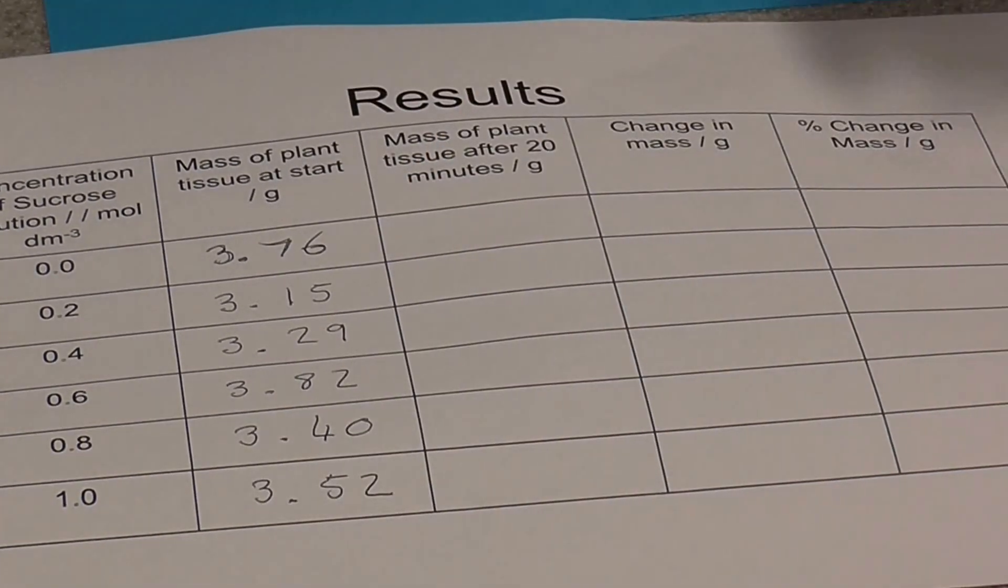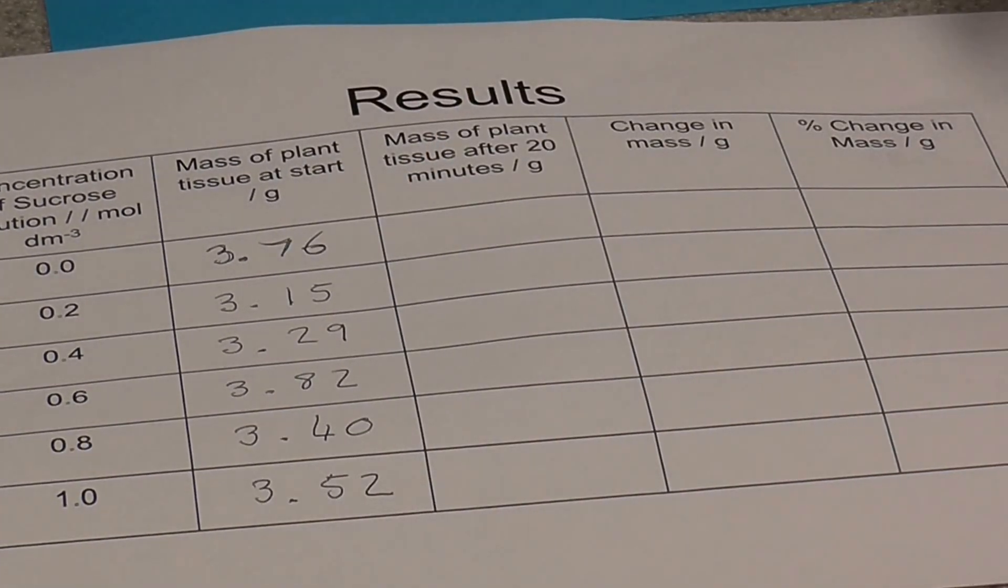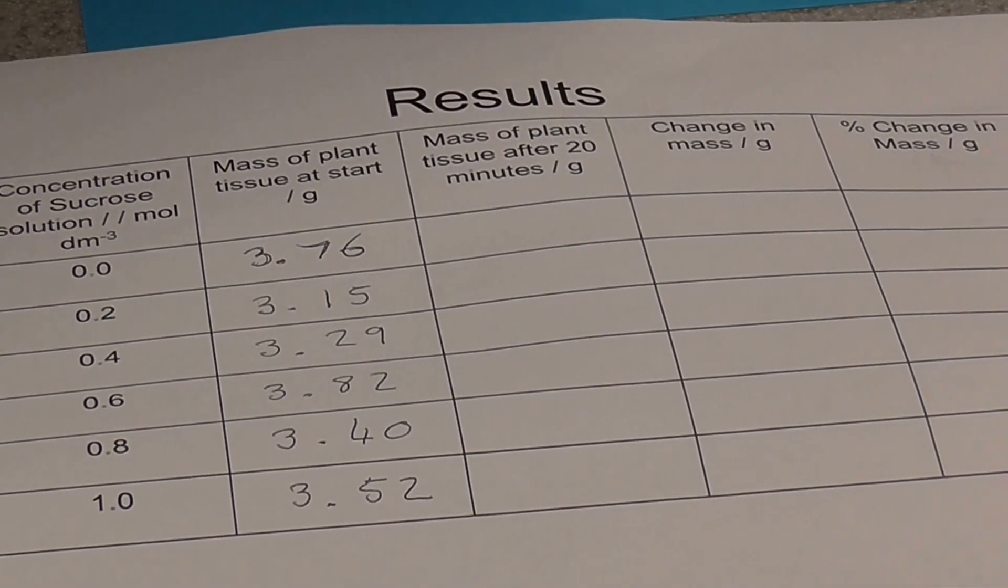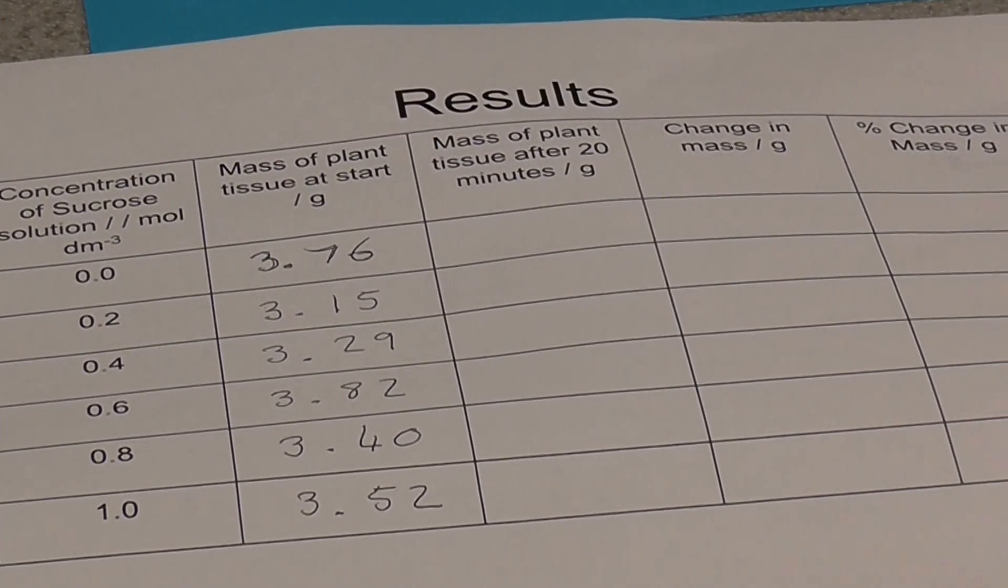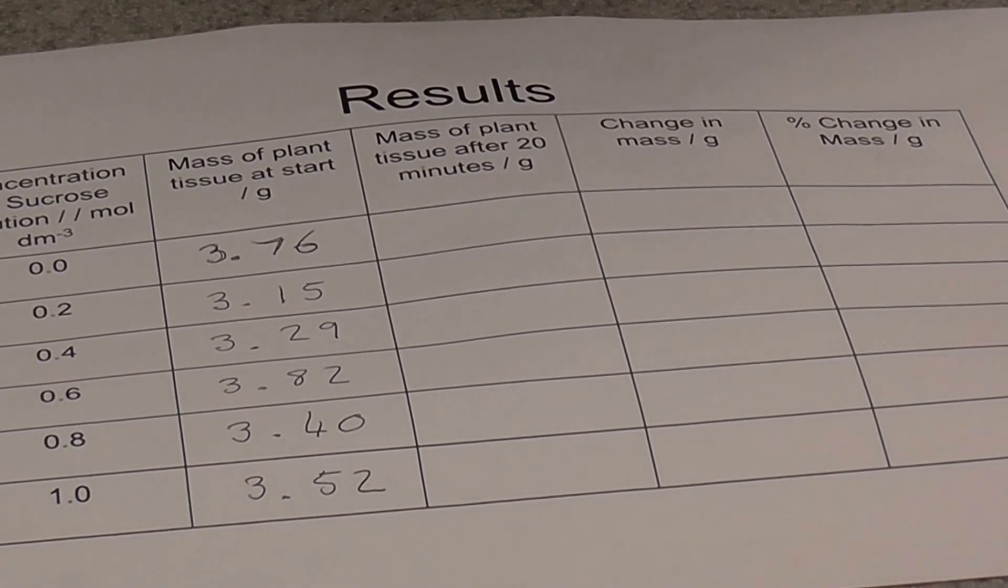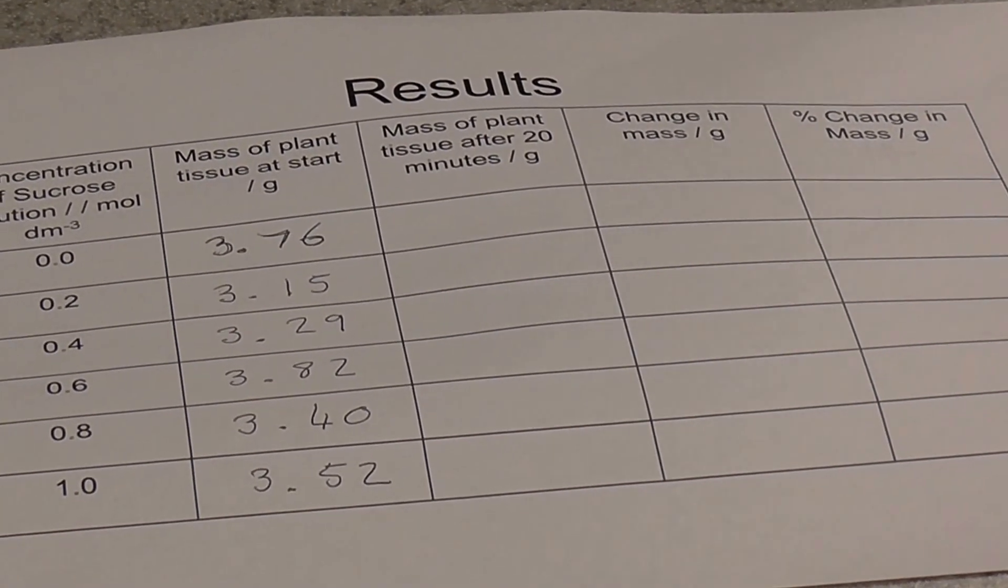As soon as you've weighed every single potato chip, you then need to actually go over to your water bath and place each chip in the correctly labeled solution. Then you need to leave them in the water bath, set your timer, and 20 minutes should be plenty of time for this experiment to work.